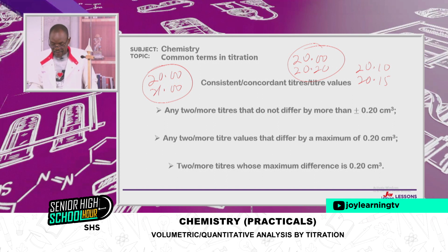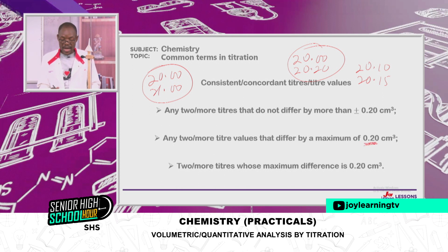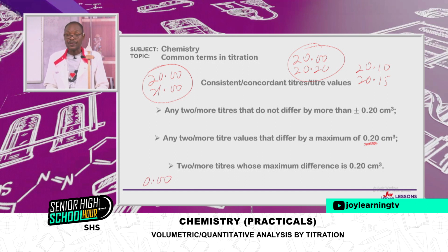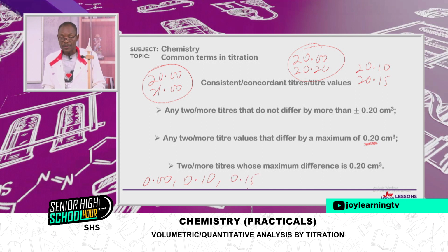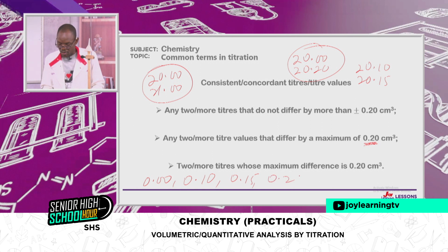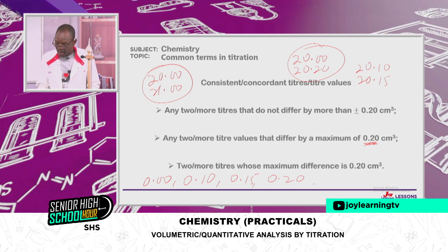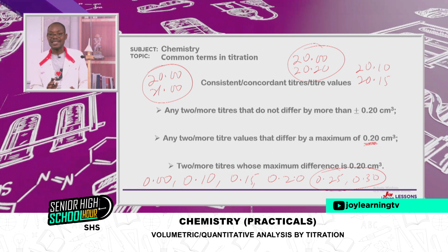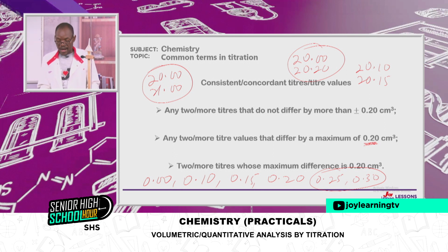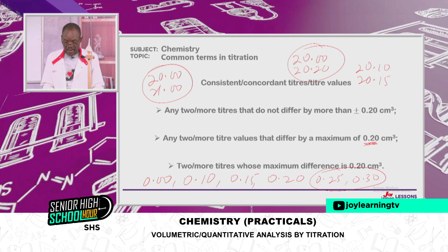Or any 2 or more titer values that differ by a maximum of 0.20. A maximum means that I can have 0.00 difference, I can have 0.10 difference, I can have 0.15 difference, and then I can have 0.20 difference. Maximum difference. More than this, say 0.25 or 0.30, your values are not consistent. So these are guiding principles that when you are running your titration, you guard against these things.